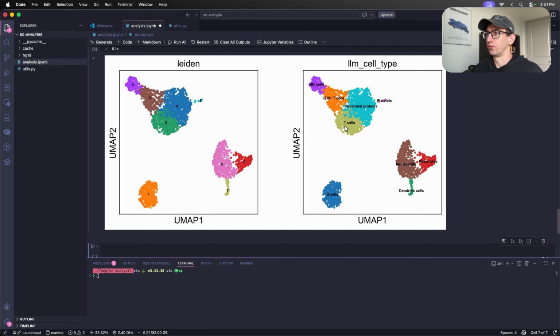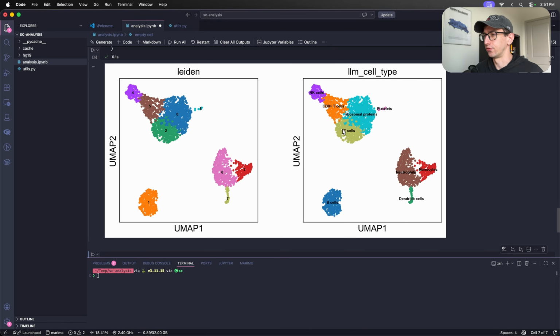Anyway, every time we use large language models in bioinformatics, it's very important to have some sanity checks and to perform some double checks. In this video, I will not focus on it. I just showed you how you can, for example, think about your tasks, and sometimes you can come up with a possible way to improve and speed up the work that you are doing. In this particular case, we tried to do some of the steps that are usually done manually by using the large language model.